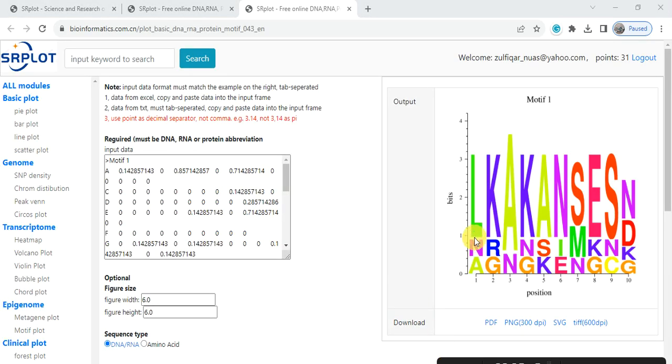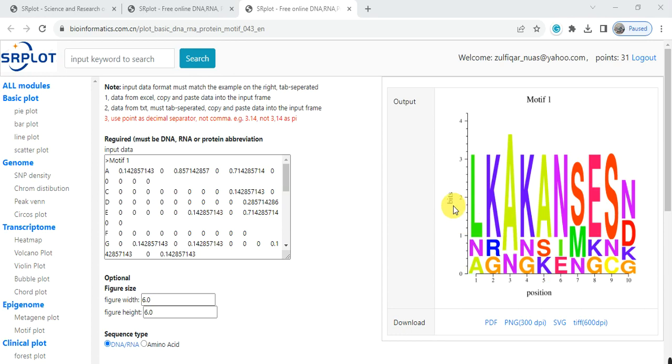Now we have the motif logo from the position weight matrix of each amino acid. You can download it in the form of TIF or PDF and then use it.